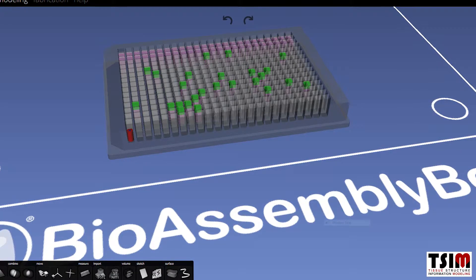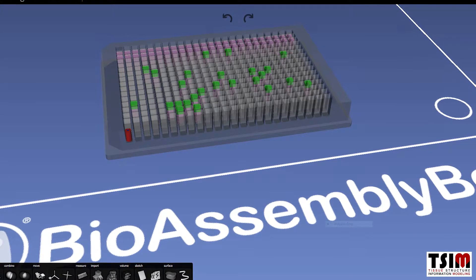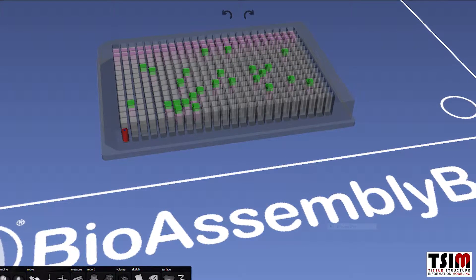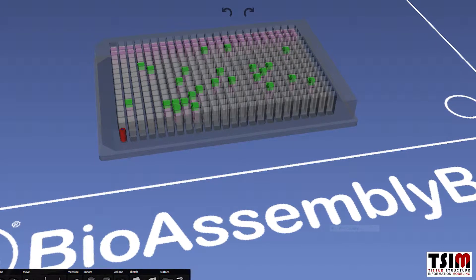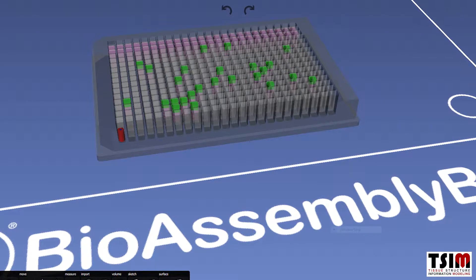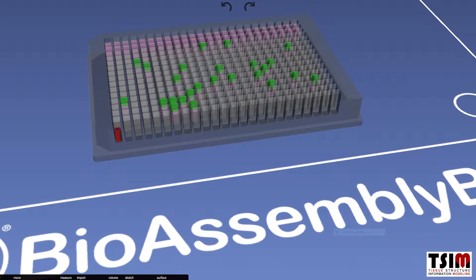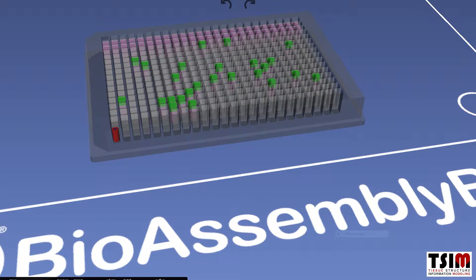Shown here in TSIM is a 384-well plate with three different plans or applications: one shown in purple in the rows across the back to highlight precision and reproducibility; in green, depositing different cell matrix systems into specific wells to reflect precision and accuracy; and finally in red, a two-compartment cell scaffold system to show tissue construction within one of these wells.